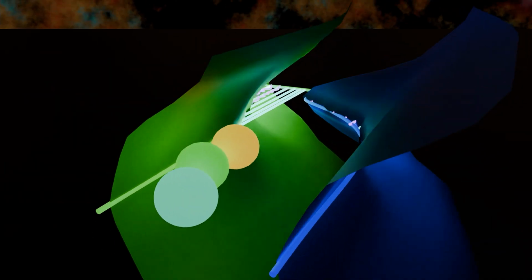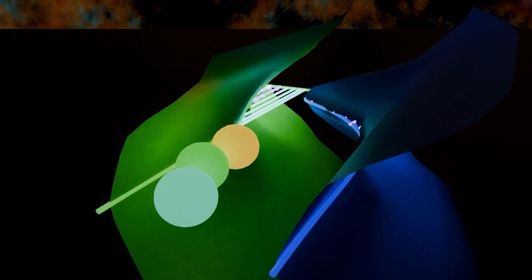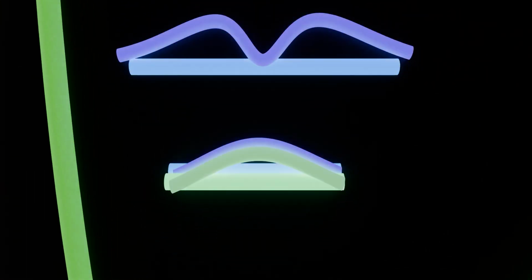As you can imagine, things get much more complex when we move from 2 atoms to 3 or more atoms in a molecule, because this graph is no longer 2D. So extracting all this energy information, along with all the angle stuff from before, gives a ton of insight into what the molecules are actually doing. So that's my research. Hopefully we've managed to paint a bit of a picture for how we go from putting something into a completely unknown mystery machine of death to how we actually get information about our molecules out.